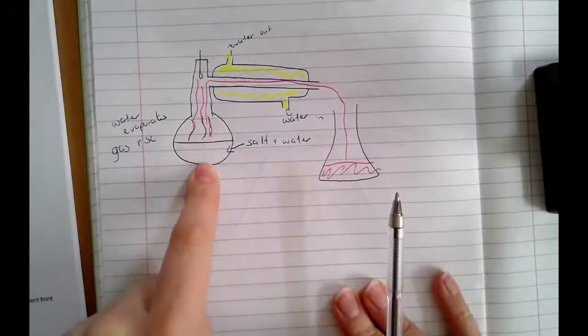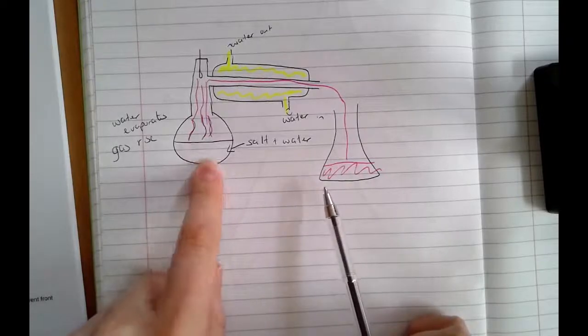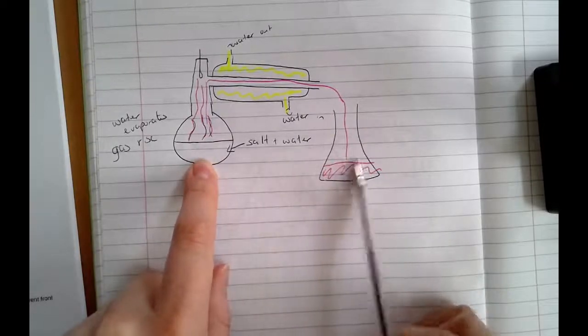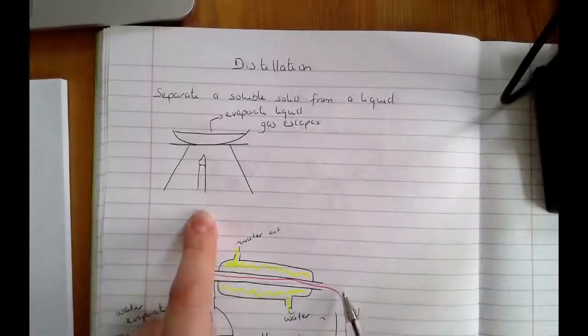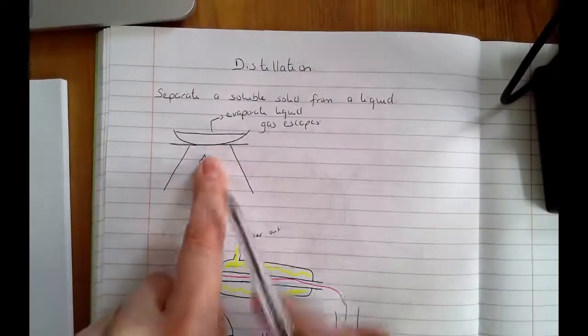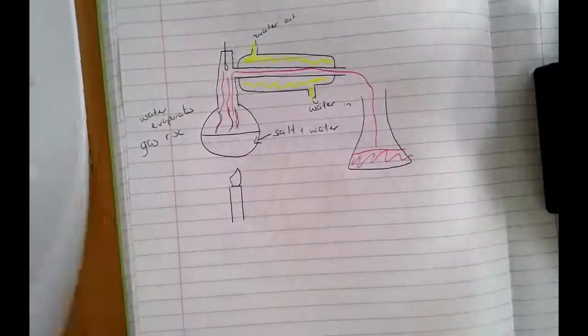The salt has a really high melting point, so it's going to stay in your round bottom flask. So at the end you've got the salt in your round bottom flask, and you've got the water here in your conical flask. The advantage over crystallization is that in crystallization, yes, you're left with your salt, but you've lost all your water. In distillation, you end up with both.